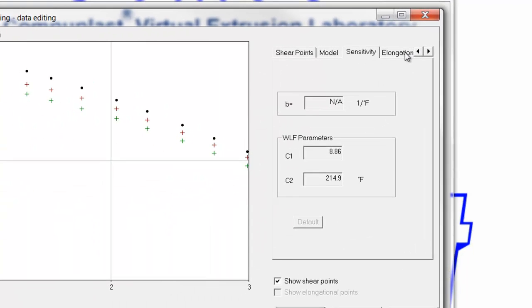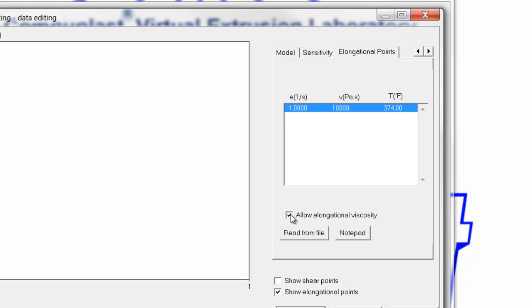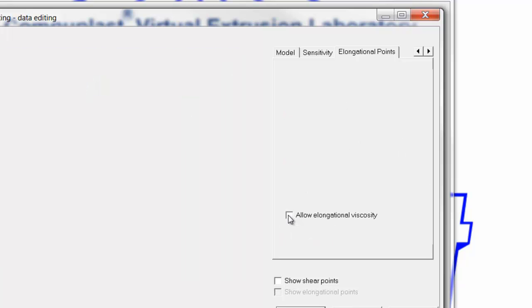The last tab we have here is elongational points. We do not have any elongational points, but if we did, we would simply click allow elongational viscosity and enter this data in a similar fashion to how we entered the shear viscosity data. But since we don't have it, we'll turn that off.